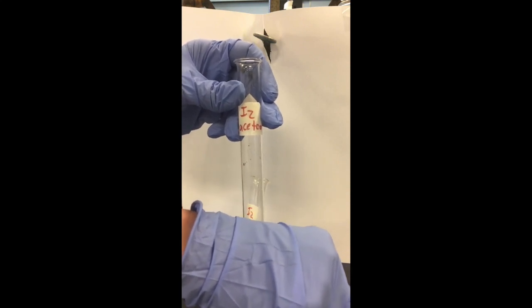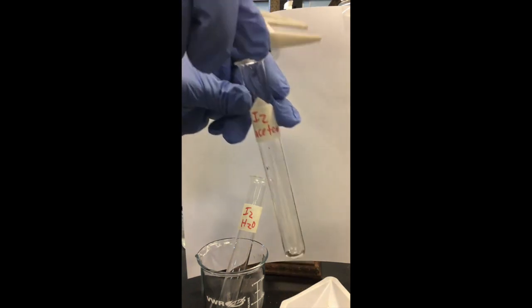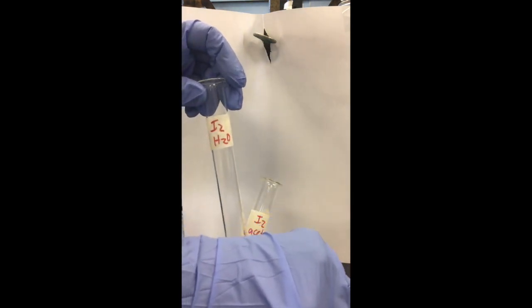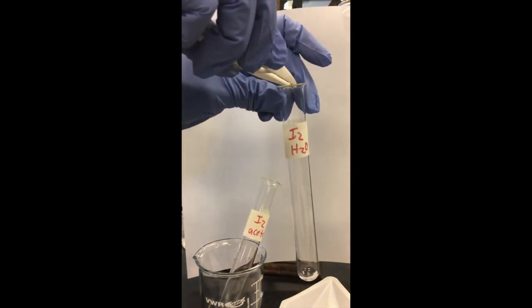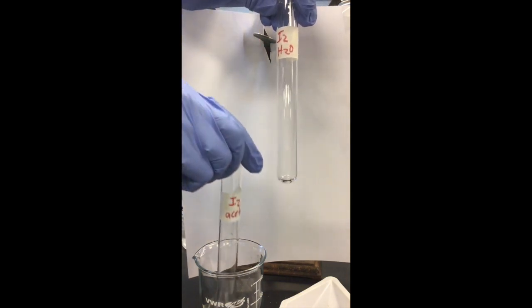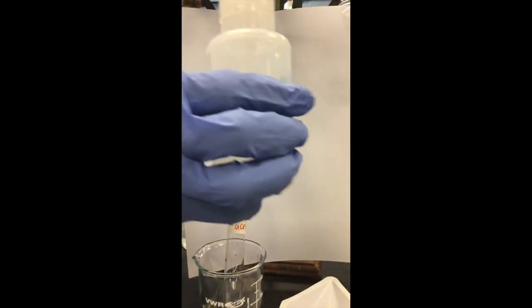and labeled always. So I'm putting an iodine crystal in here, and the iodine crystal that I put into my other test tube, I want to make sure it's of equal size so we can do a comparison here. And you want to make sure you take small crystals. Okay, so I have my iodine crystals of approximately equal size in both my test tubes. Now I'm going to add water to one of the test tubes. So I have some deionized water. I'm going to put in 2 milliliters.